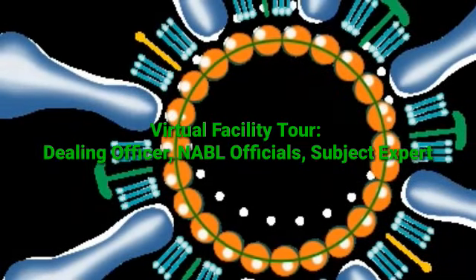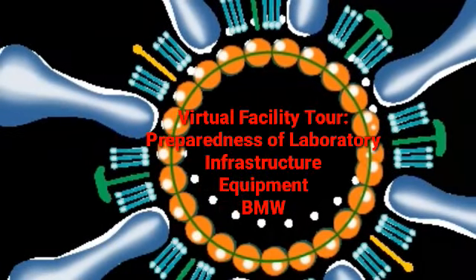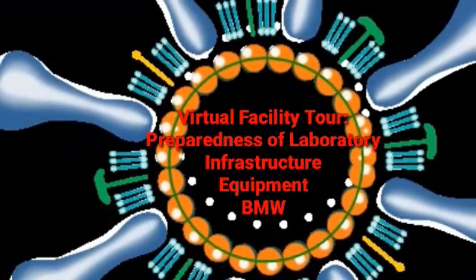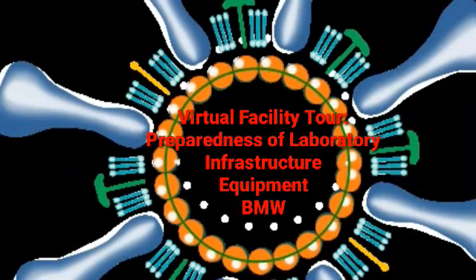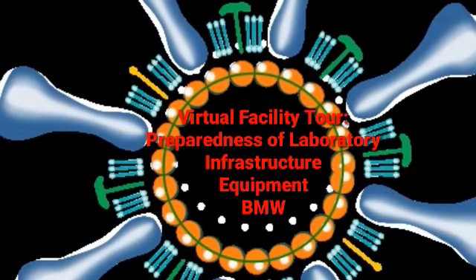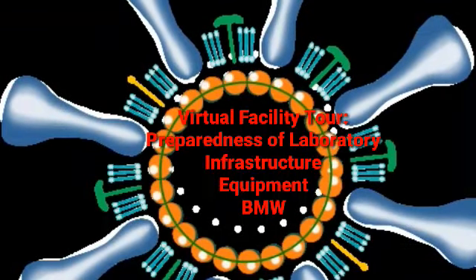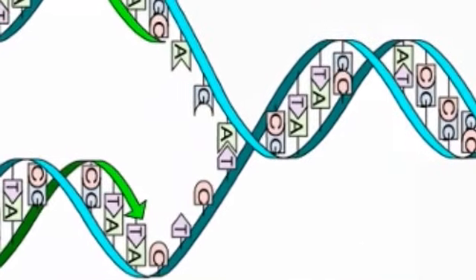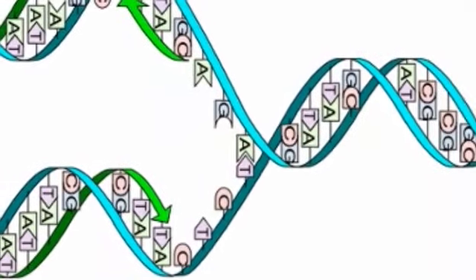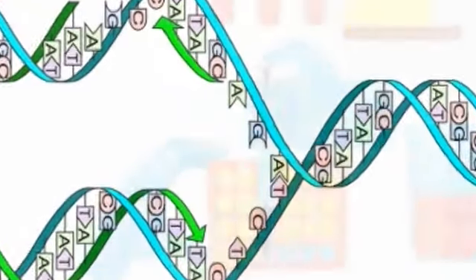After the scrutiny, there will be a facility tour by the dealing officer along with a subject expert and other officials of NABL. This facility tour mainly involves the preparedness of the laboratory. The subject expert will look into the infrastructural requirement and equipment requirement, and will see whether the laboratory is ready for accreditation and whether the infrastructure is sufficient to go for NABL accreditation for real-time PCR based RNA viruses.